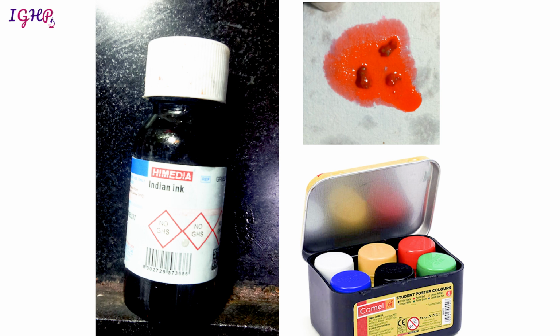Otherwise, for specimens in which you have only one near margin, like the CRM, circumferential margin, in colon tumor resections, you can just ink the area where you think the tumor is closest to that margin. For soft tissues, generally we ink the entire outer surface. And for breast and skin resections, generally the entire base of the mastectomy or the entire base of WLEs is inked.